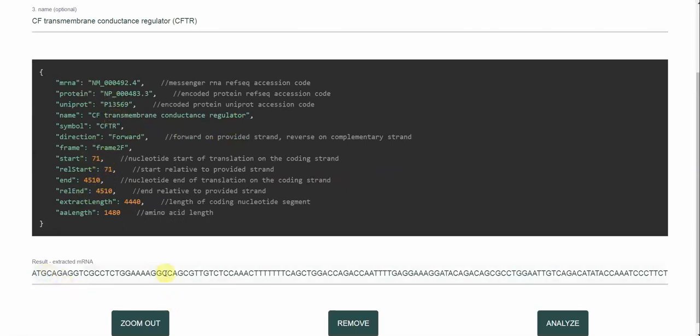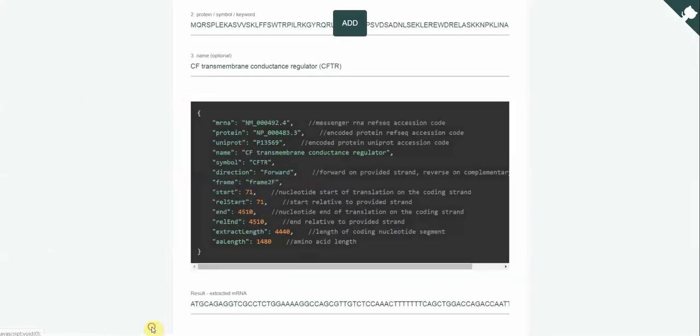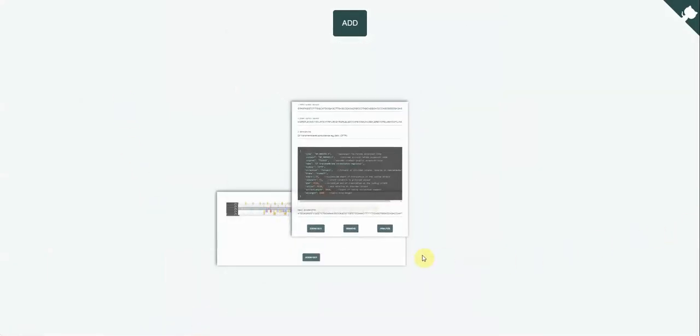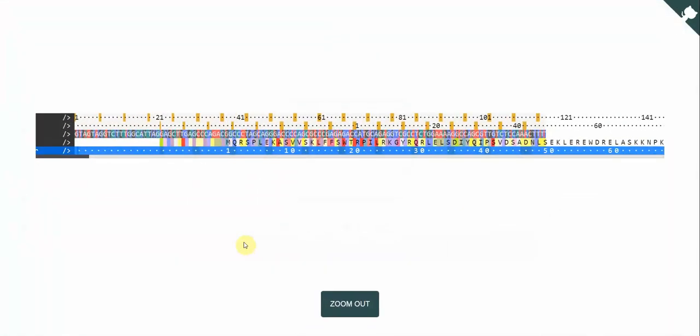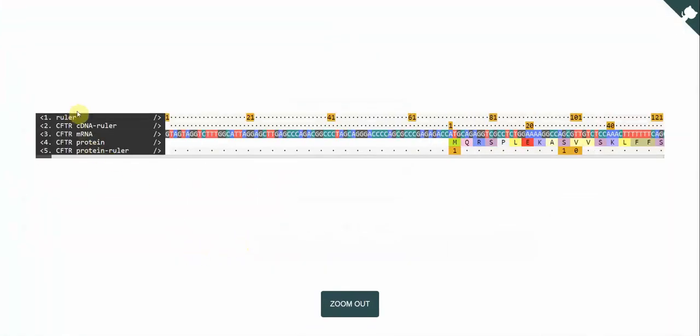And underneath you have the extracted mRNA. So what you can do is click the Zoom Out button and then you will go back to the main panel. And on the back side of it, you will see a sequence display. So what you have is all the mRNA and the protein sequences justified to the left. You have the cDNA ruler, the mRNA sequence, protein sequence and the protein ruler.